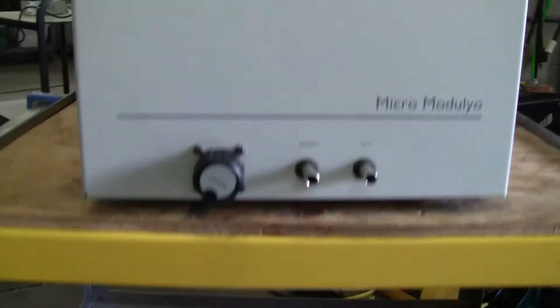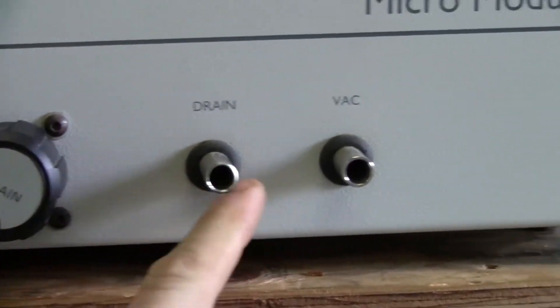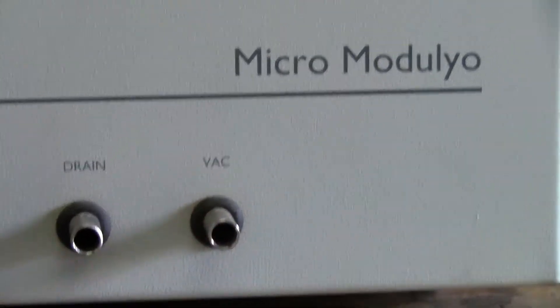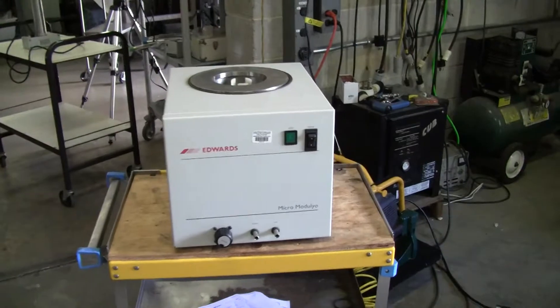You can see down here — it's our valve for our drain, our drain port. It's a vacuum port. This unit does require a vacuum pump in order to function properly.